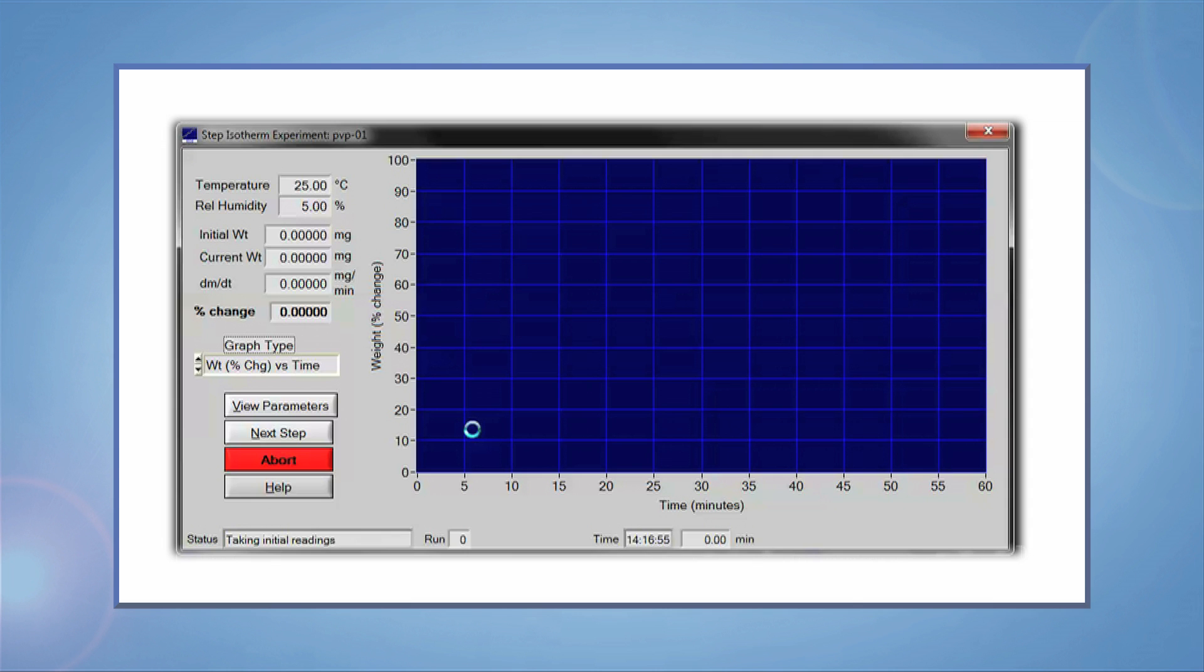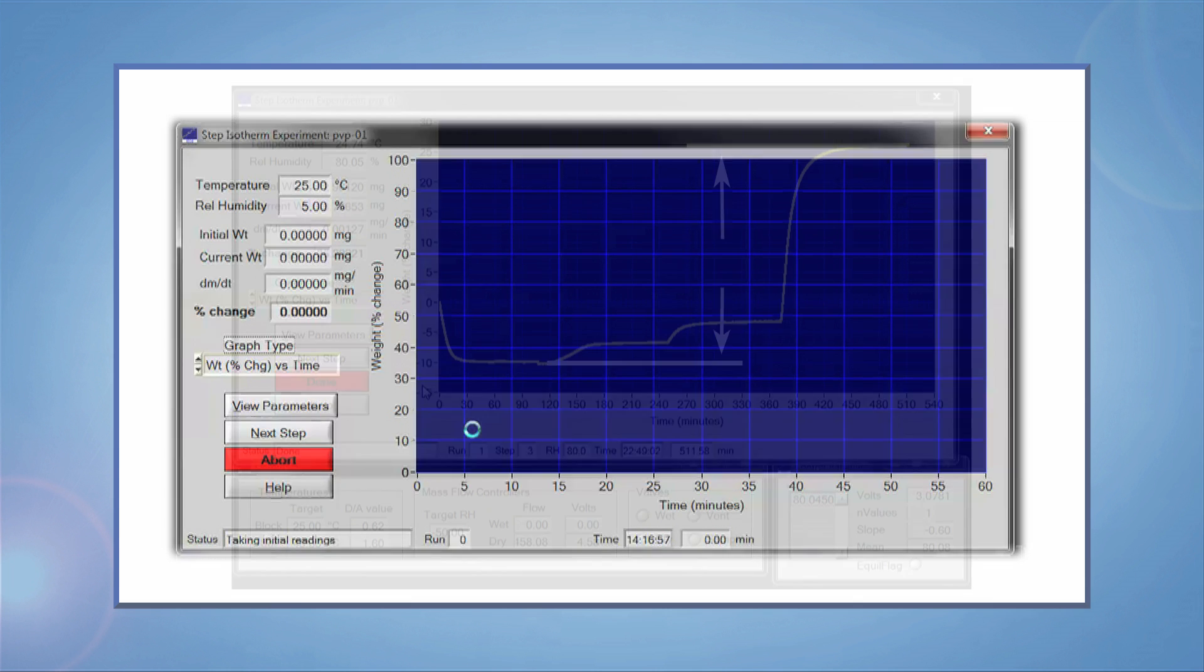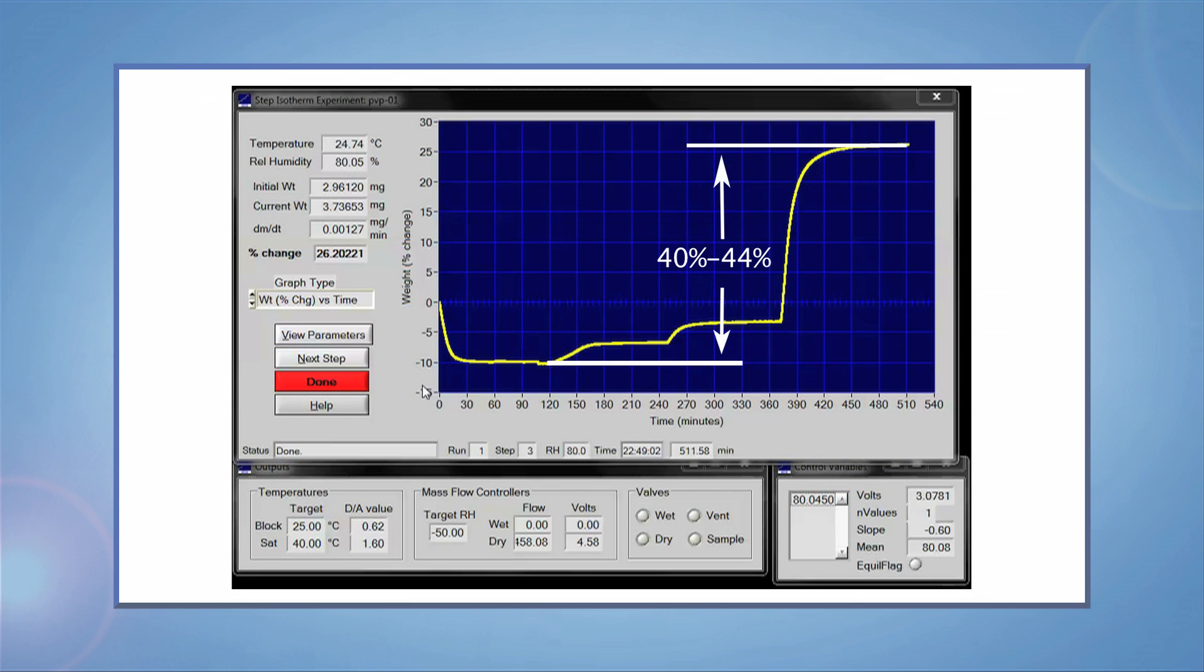You can stop the experiment early if you desire. After completion, the PVP results should show a total weight gain of 40 to 44% at 80% RH.